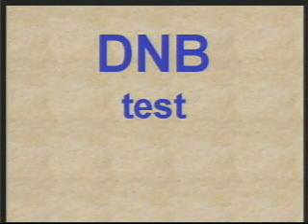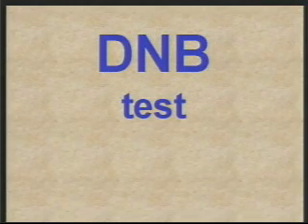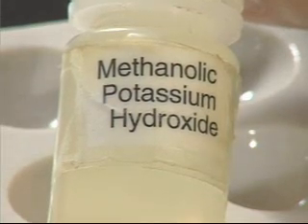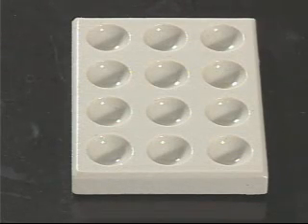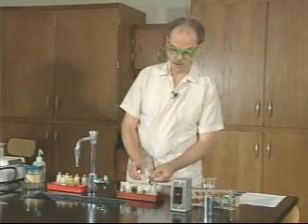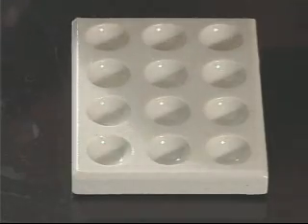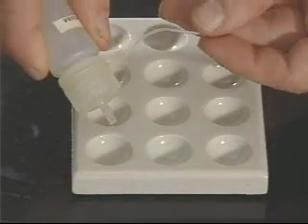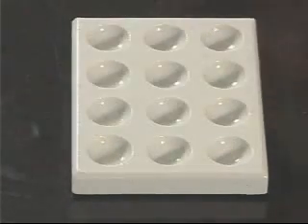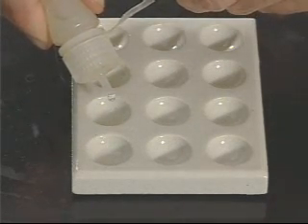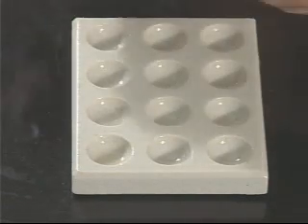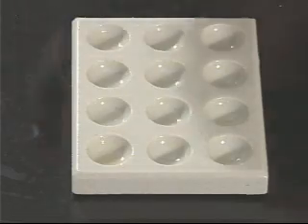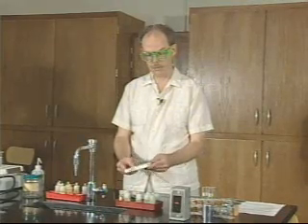The final test I'm going to show you is the dinitrobenzene test, or the DNB test. This test starts with the methanolic potassium hydroxide — you're going to use four wells in this test. Be sure in this and all the tests involving the spot plate that the spot plate is clean and dry. Put in two drops of the methanolic sodium hydroxide in each of four wells, followed by two drops of the standards: two drops of the first standard into the first well, two drops of the second standard into the second well, two drops of the third standard into the third well, and two drops of the final standard into the final well. Mix it up by just rocking the spot plate gently a few times back and forth.